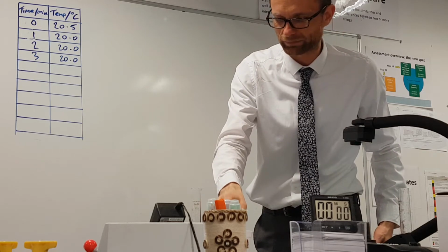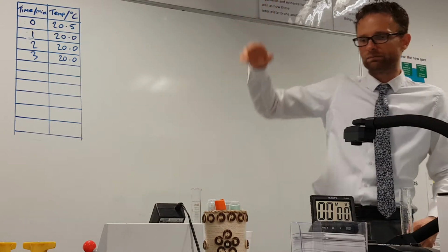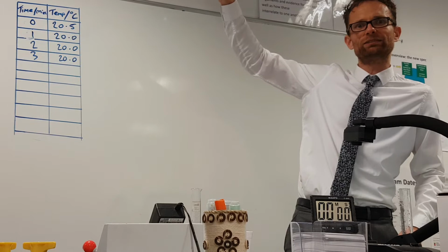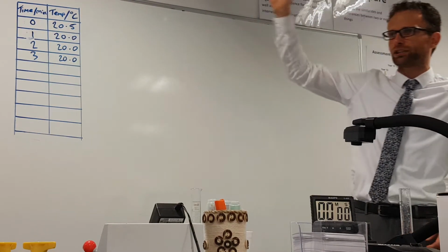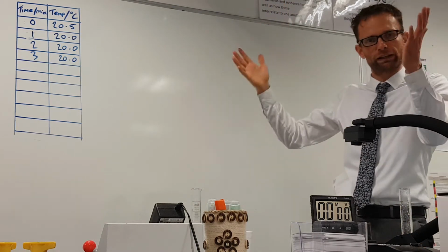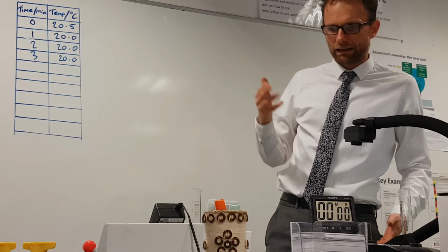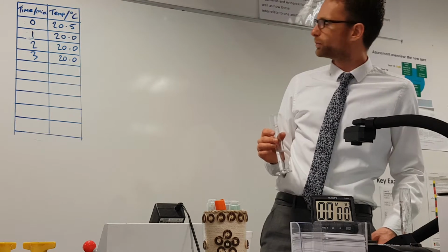It can take too long essentially, and it means that by the time the spirit in the thermometer has reached a maximum, the solution has already cooled down a bit, and so you don't actually register the full temperature increase because it takes too long for the thermometer to actually register what's going on. So this technique allows for that. It allows you to calculate what we think the real rise was.